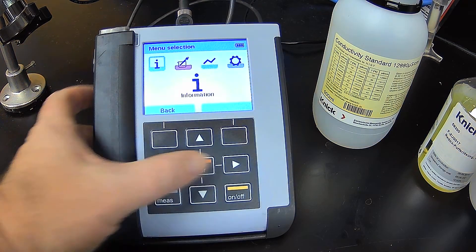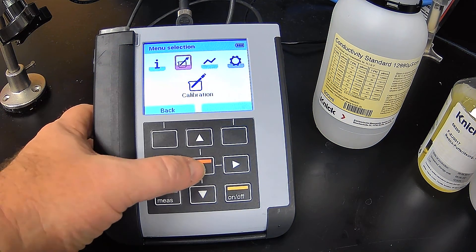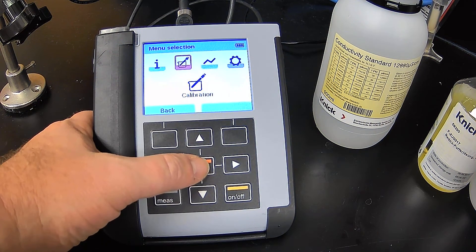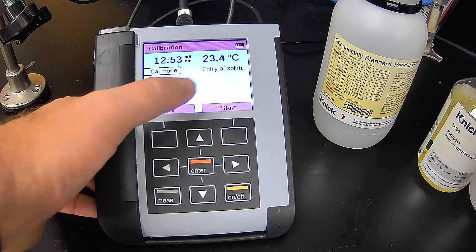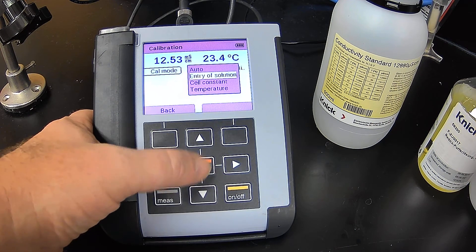So to do a calibration, I hit menu, then right arrow until I see calibration. I press enter. Cal mode - entry of solution. You can do auto, you can do cell constant temperature. We're going to do entry of solution. Then we hit start.